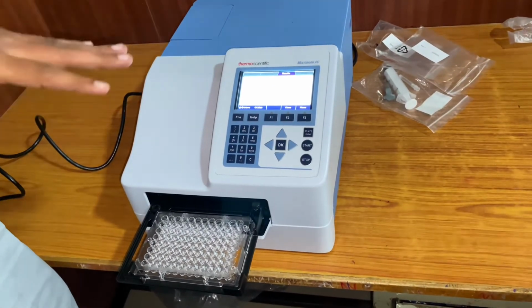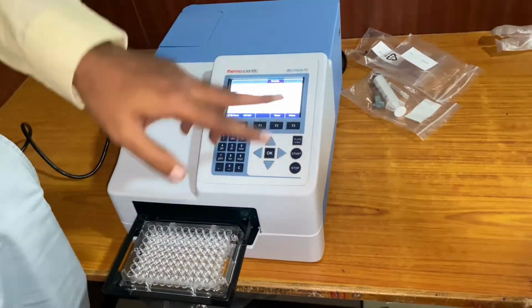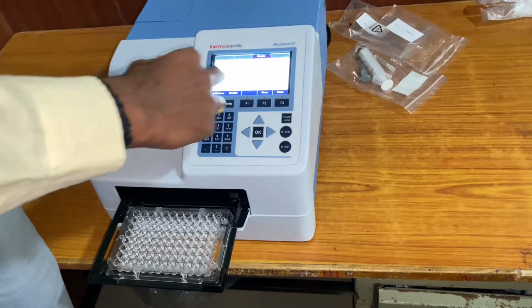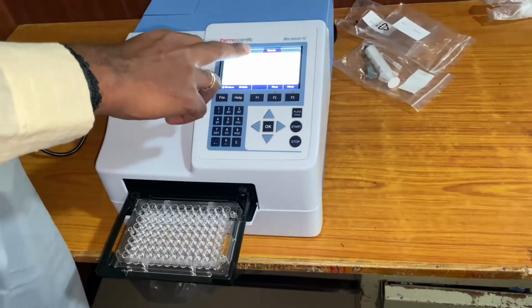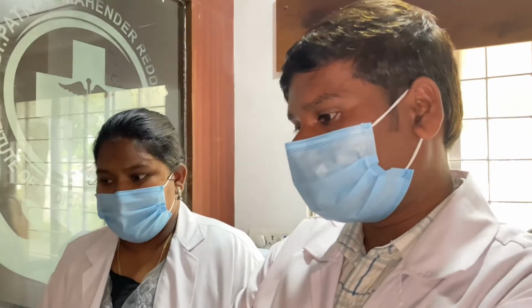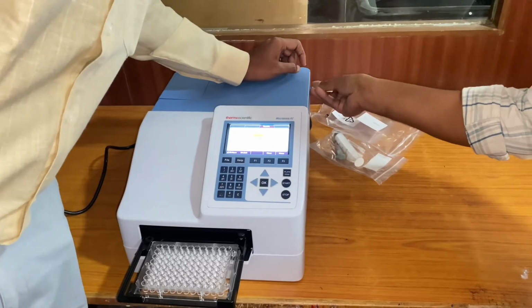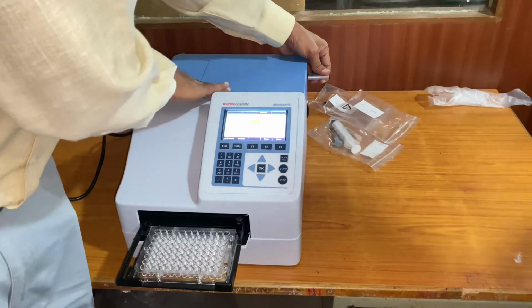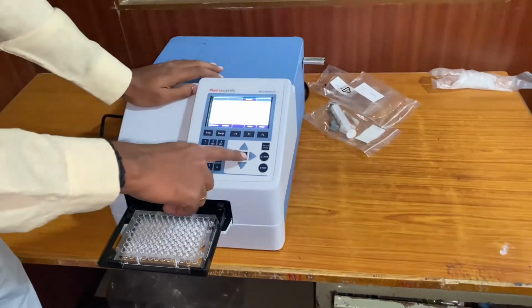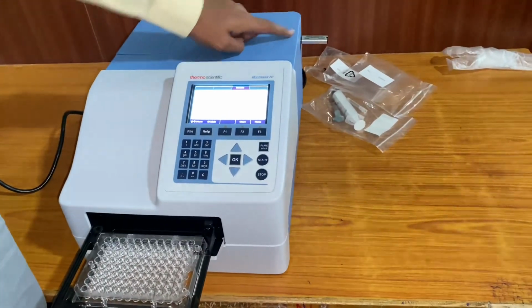Okay, once you have read the plate, all the details will be here on the screen. It will be 1 to 96, so individually you will get all the data here. To export this, we gave a pen drive along with the instrument. Here you see the file option is there. Export as, so here export. So data exported to control. This is only a reader.